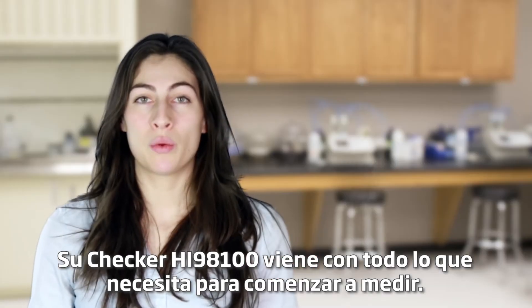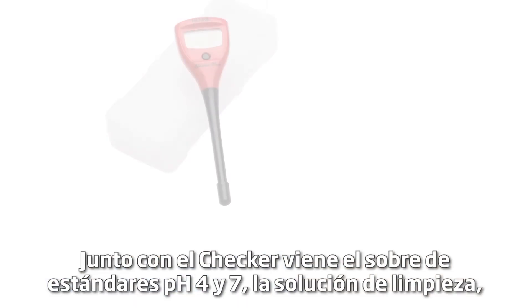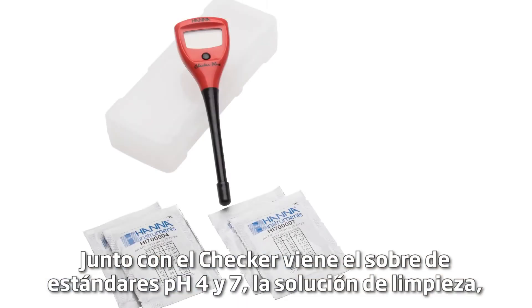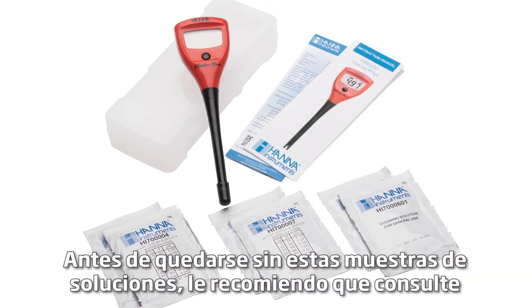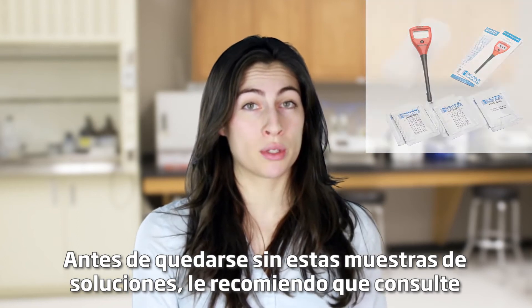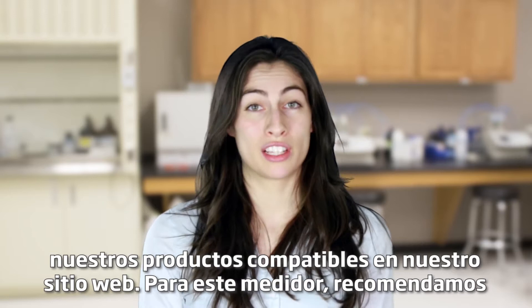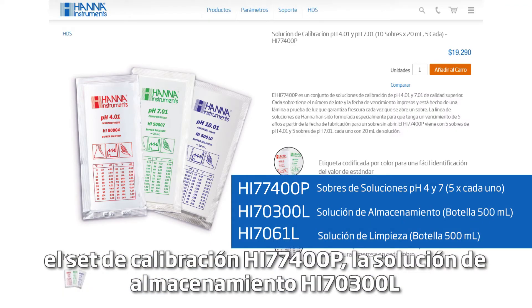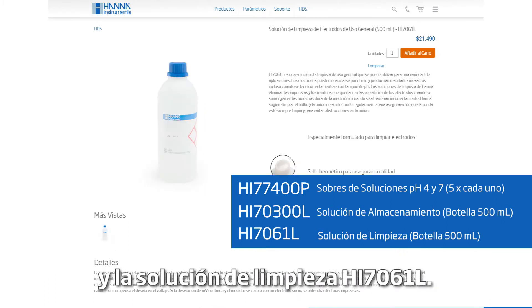Your HI-98100 Checker comes with everything you need to begin testing. Along with the checker comes buffer four and seven packets, cleaning solution, the manual, and quality certificate. Before running out of these solution samples, I recommend you check out our compatible products on our website. For this meter we recommend the HI-77400P calibration set, the HI-70300 storage solution, and the HI-7061 cleaning solution.